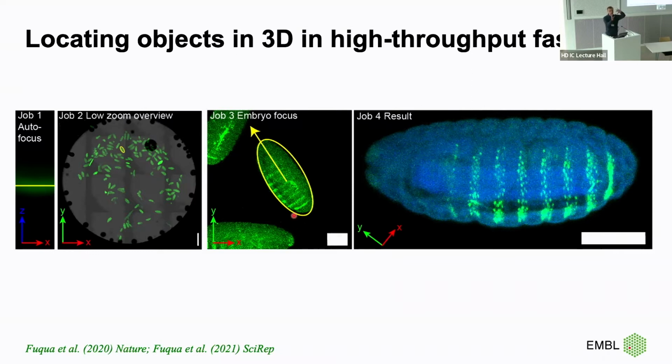And then we could also define the rotation, right? Because the embryo has a conventional shape, you can calculate the bounding box in 3D and configure your final acquisition such that it captures the 3D image in the most efficient manner, right? So the take-home message from that: sometimes we need more than 2 settings and more than 1 feedback step to actually achieve what we really want, in order to make our protocol optimal.